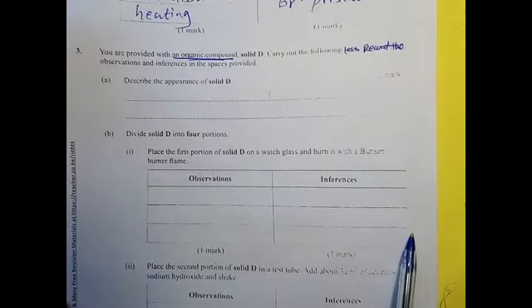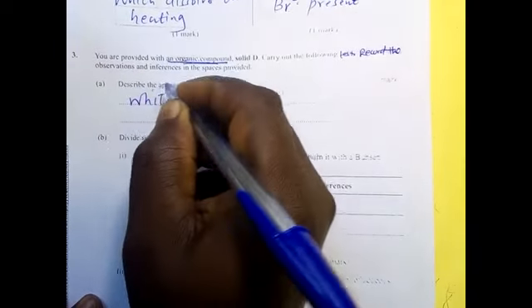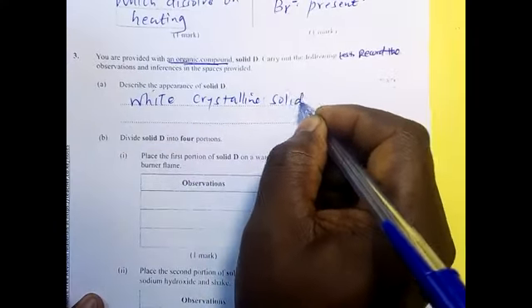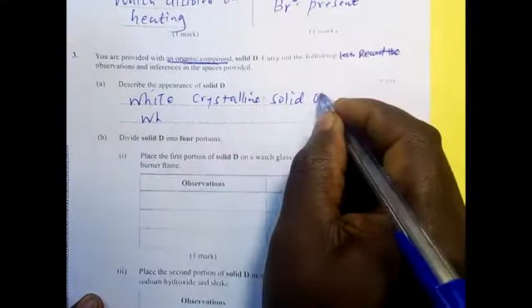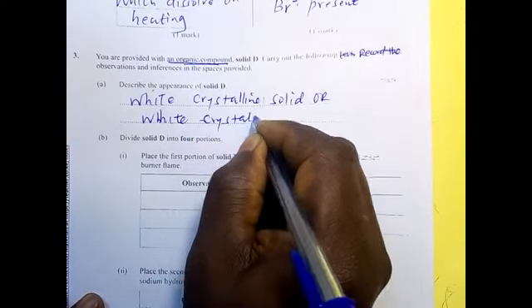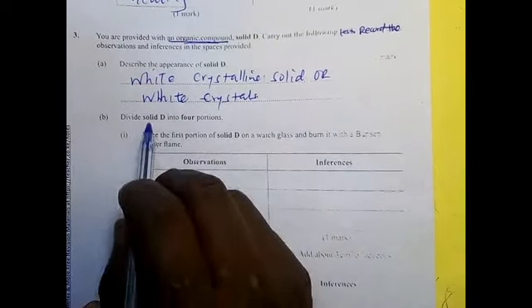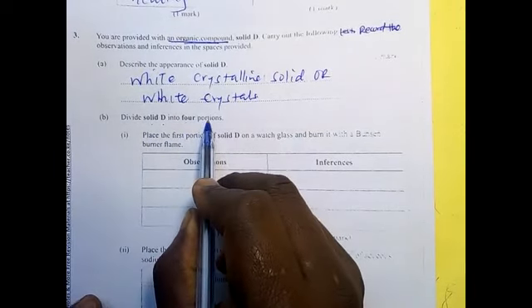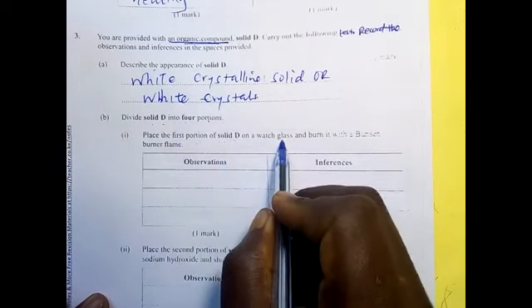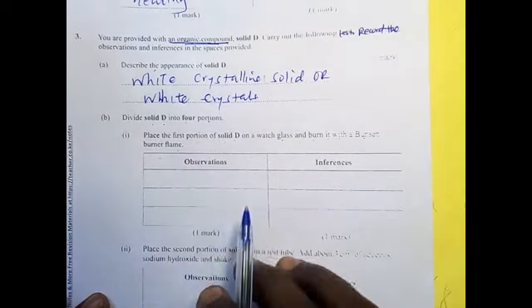Describe the appearance of solid D. It was a white crystal, therefore you say white crystalline solid. Or you can say white crystals, because the salt was white. Divide solid D into 4 portions. Place the first portion of solid D on a watch glass and burn it with a Bunsen burner flame.